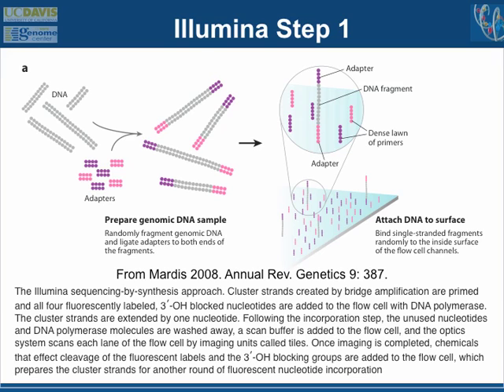And what you do is completely cool. You basically have a slide, and on that slide you've spotted some PCR primers that correspond to the adapters that you've ligated onto the end of your DNA pieces. You then, in essence, covalently link your DNA onto the slide in random spots all throughout this slide.